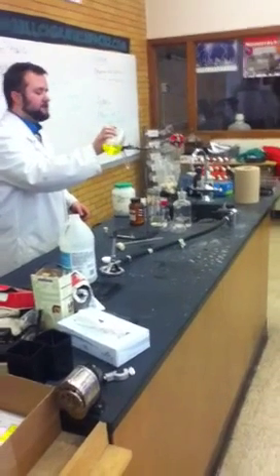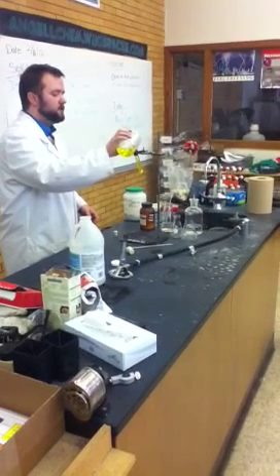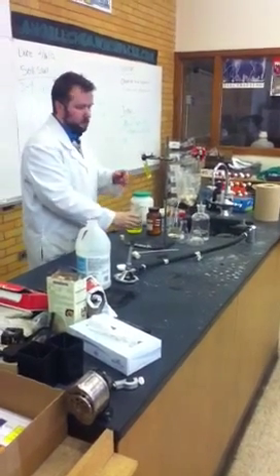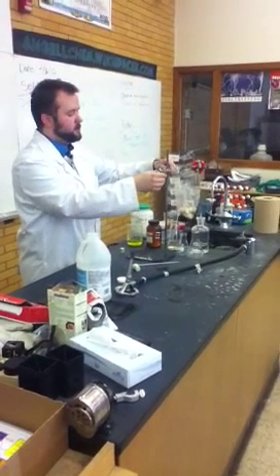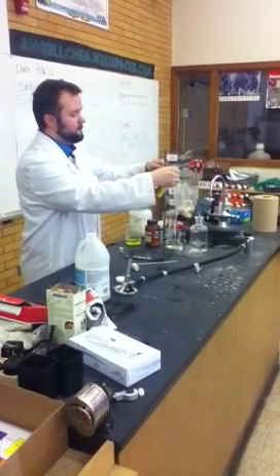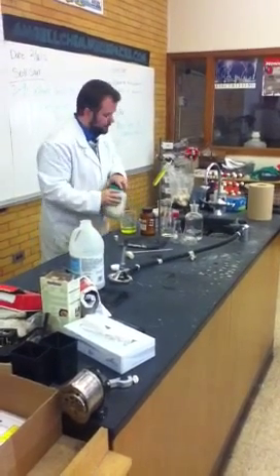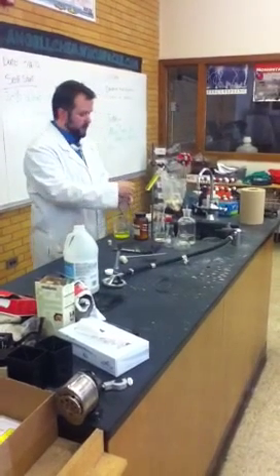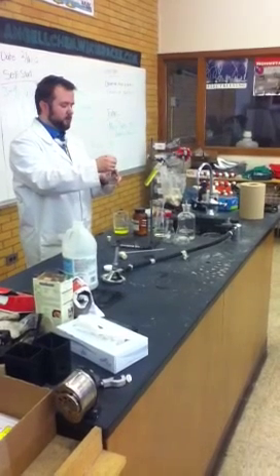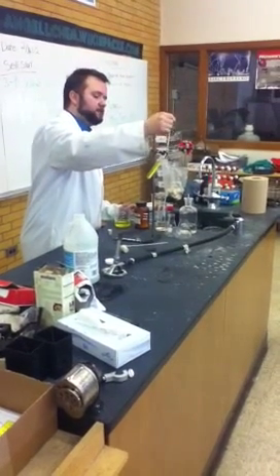Potassium chromate, when you dissolve it in water, makes a lovely yellow solution. Go ahead and turn this a little bit so that everybody can watch. So we've got potassium chromate, and we've also got here silver nitrate. We'll look at this reaction in just a second, but let's see it in person first.